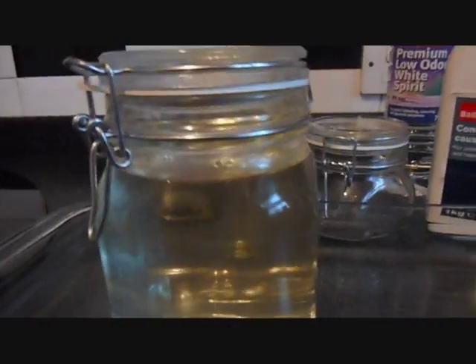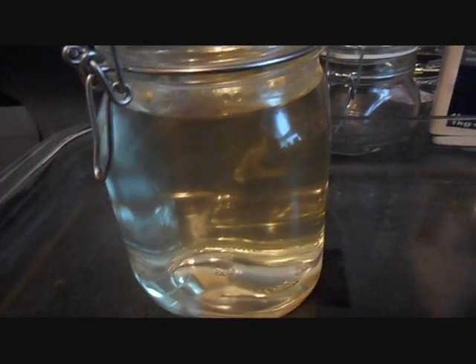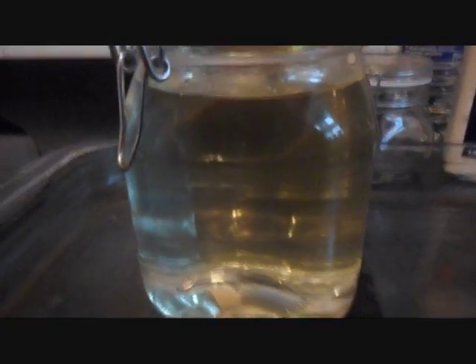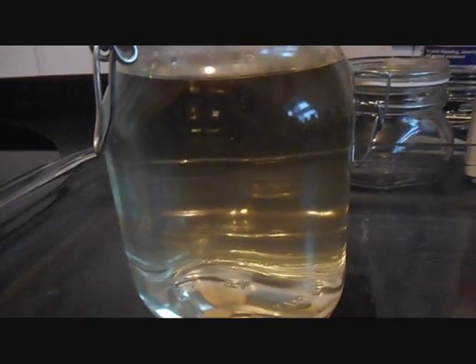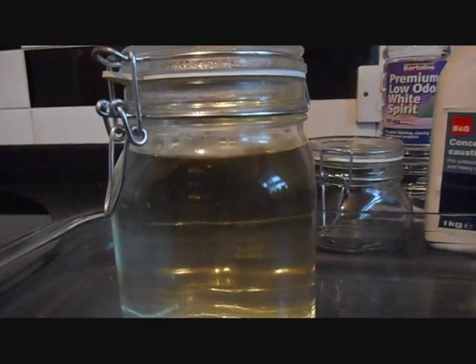Okay. Right. Here we have the Dead Sea salt, probably about half a kilo, I would say, dissolved in water and then mixed hot with half of it with distilled vinegar. So it's 50-50 water and vinegar. You can see like a yellow tinge to it. I'm not sure what that is, but we'll see. This will be really interesting to see if we do get something out of this. I don't expect to, but it'll be a surprise if we do.